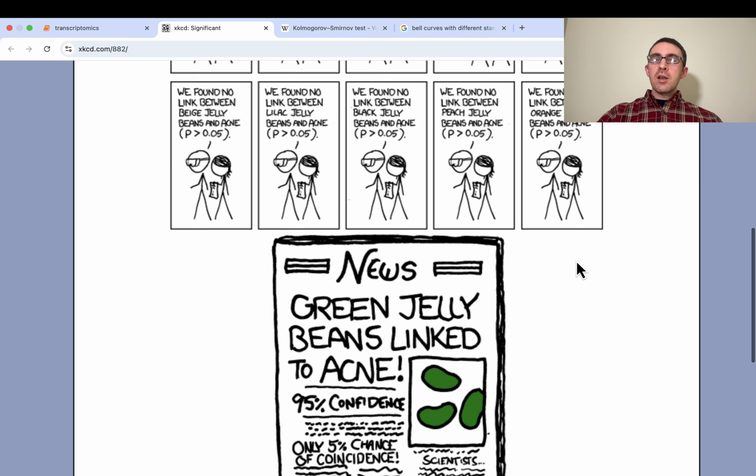The fold change is just the mean of the IPF samples divided by the mean of the control samples for this gene. That would be a straightforward comparison of how high or low the gene expression was in the IPF samples compared to the control samples in terms of their means.